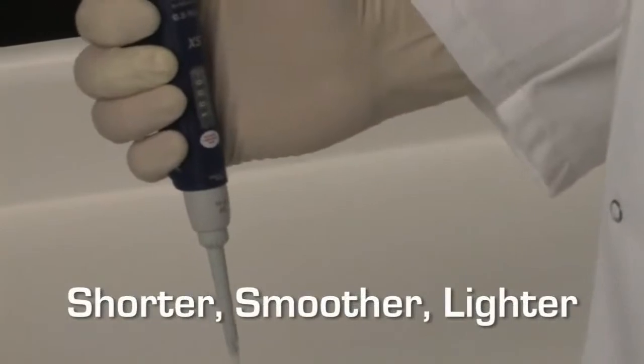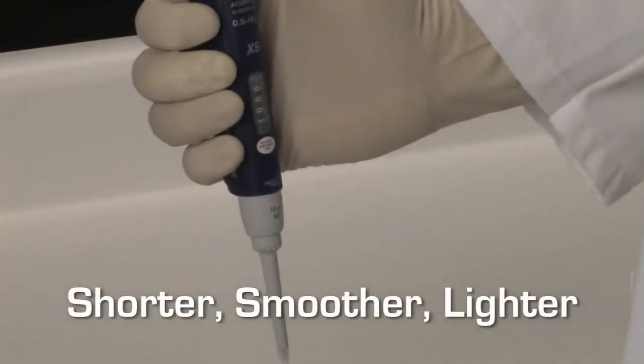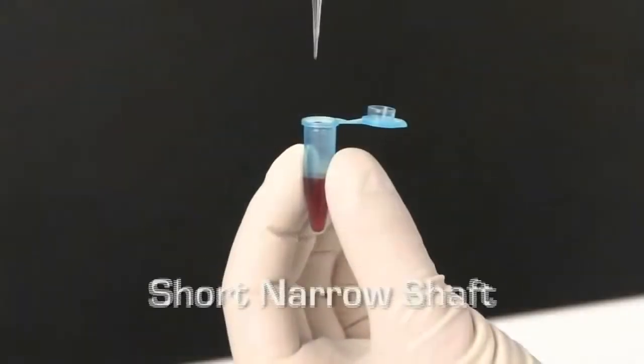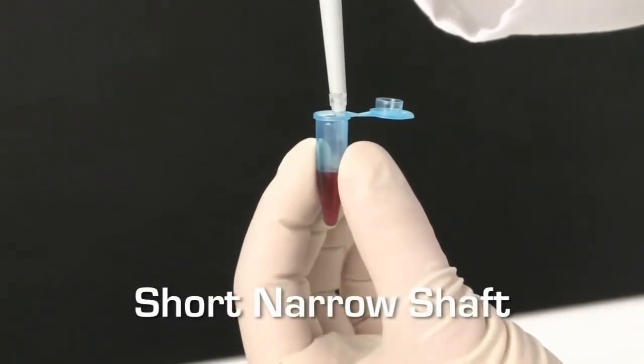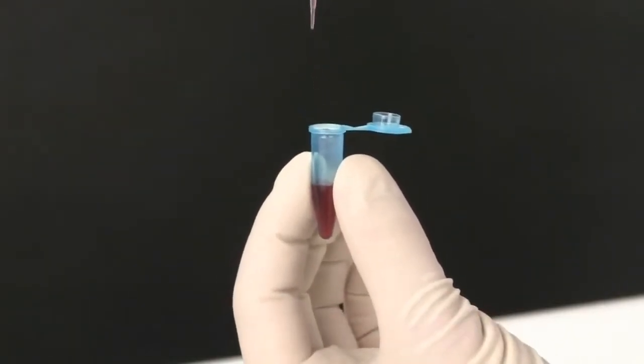The 826XS is shorter, smoother, and lighter. The short, narrow shaft enables dispensing into the tighter opening of smaller microtubes without contaminating the procedure.